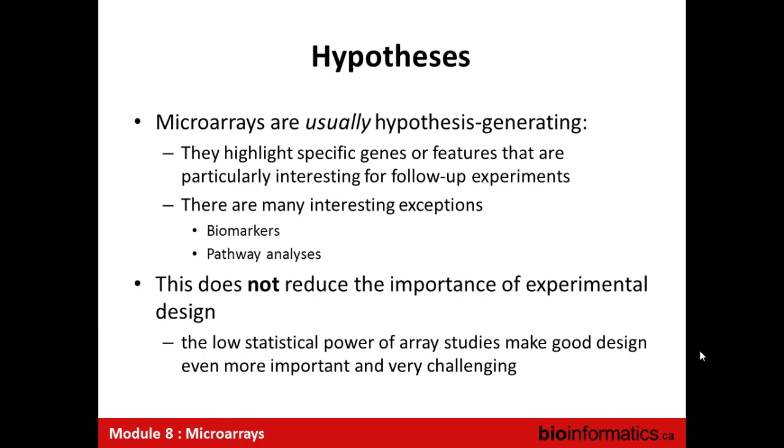And in general, although not exclusively, we don't use microarrays as a technique to verify hypotheses, although there are clear exceptions to that. Instead, we usually use them to generate new ideas, new questions. So they're kind of a screening technique. They highlight specific features or genes that are of key interest to investigate further. There are obvious exceptions, like my whole research program, which is around biomarker discovery, a hypothesis-driven experiment, not hypothesis-generating, and pathway analysis and things of that nature.